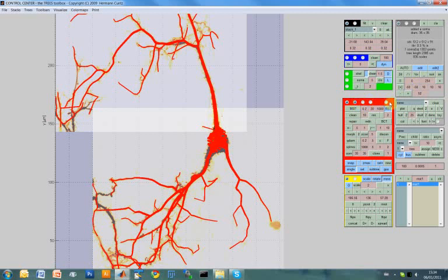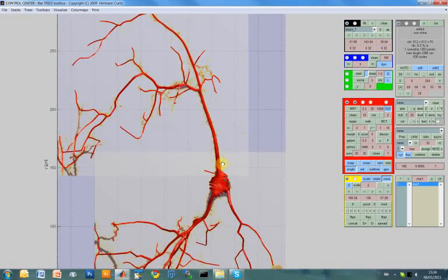Okay, I can also show this tree in full cylinder mode by clicking the red radio buttons here. Have a look at what they mean, and adding some sunshine, and you see what the reconstruction is about. And the next tutorial is then about the manual editing, because there are still a lot of major and also smaller mistakes.